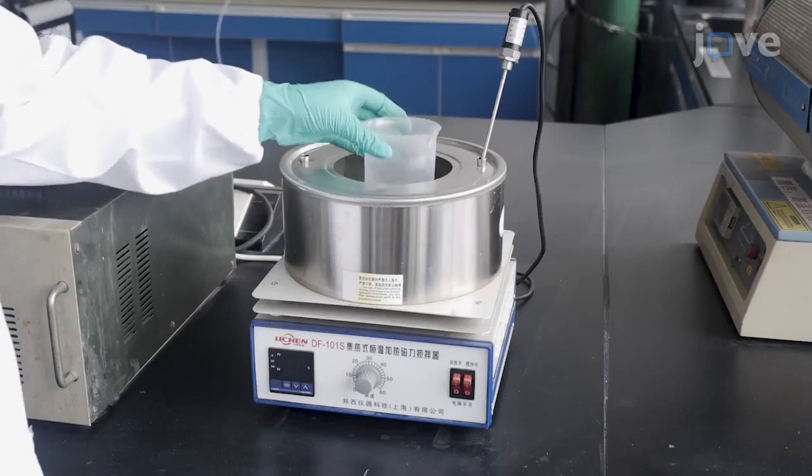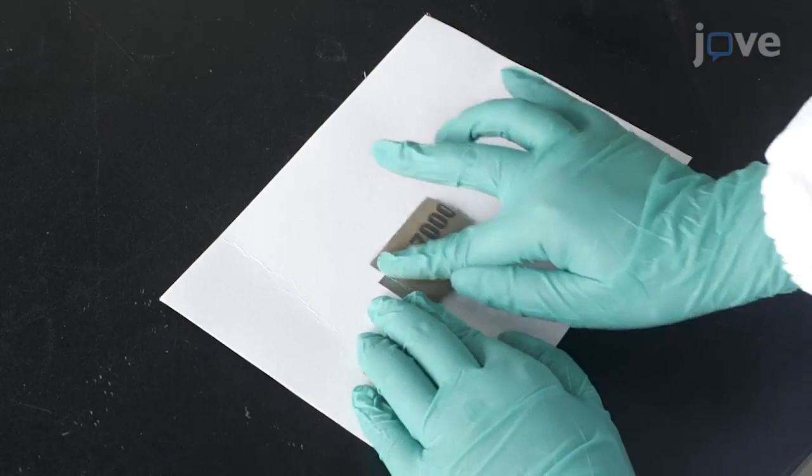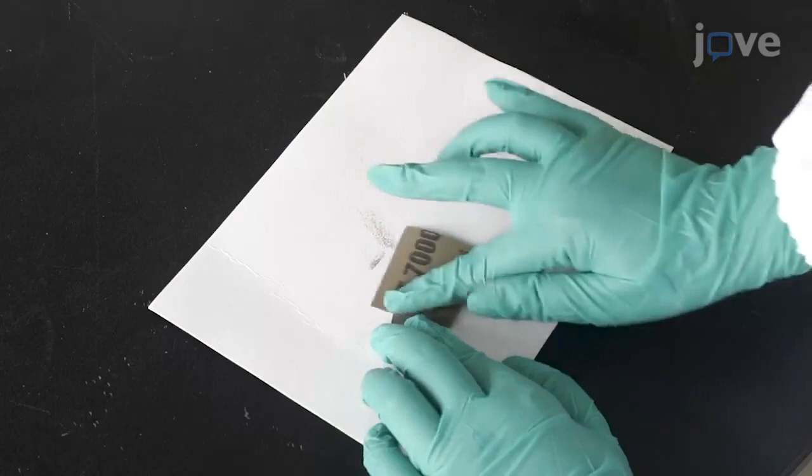Place the beaker with the electrolyte into a 45 degrees Celsius water bath. Trim the titanium foil with scissors to 25 by 25 millimeters. Then, polish the titanium foil surface with a 7000 mesh sandpaper to remove the surface impurities.